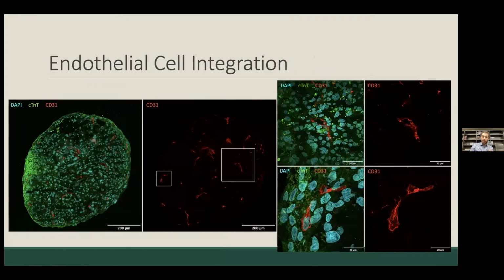Additionally, some of that viability may be explained by the rapid and diffuse spread of the other 2 cell types that were added to these specific organoids, including the CD31 positive endothelial cells. As you can see, they are even beginning to form sort of vessel-like structures here with lumens, and that's something we're continuing to explore further.